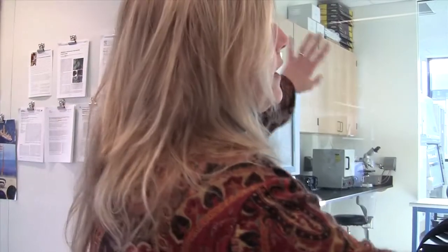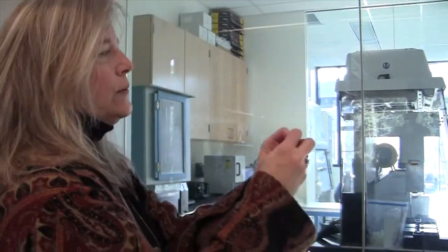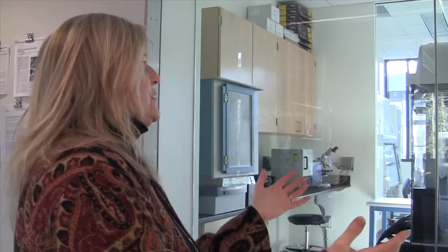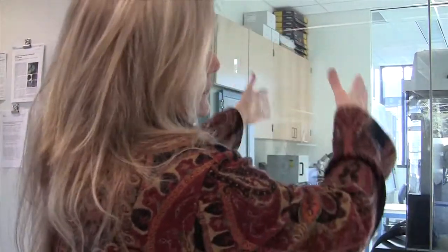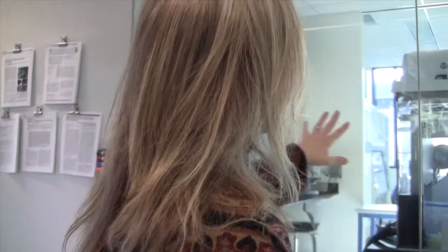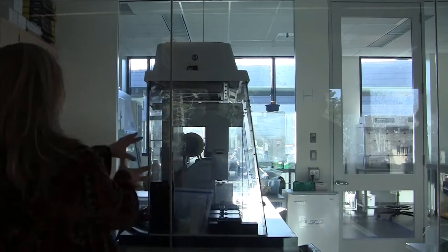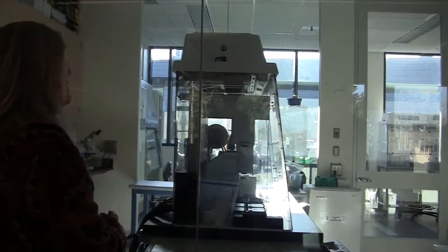Why is this all behind glass? Clearly, when you're working with microbial genetics, you don't want to contaminate it with anything. So the air is filtered, everything is behind appropriate levels of anti-contamination technology. The robot is what actually manipulates the individual tiny wells with the cells in them and so forth. So when this is running, it's a lot of fun to see. If any of you ever want to see it in action, just let me know and we can set that up so you'll be here when they're doing it.